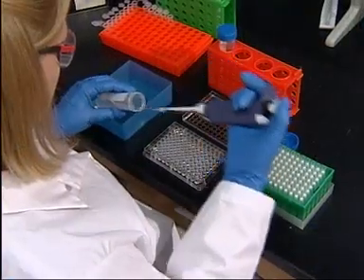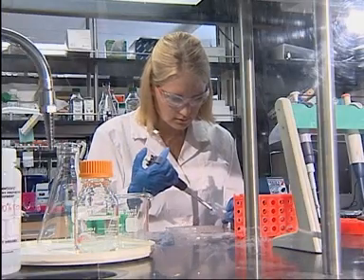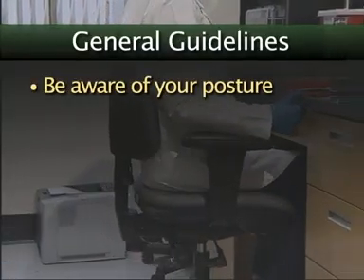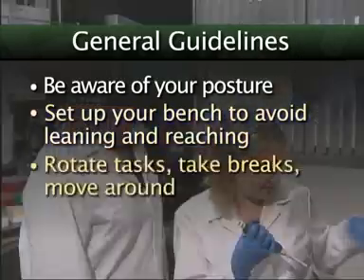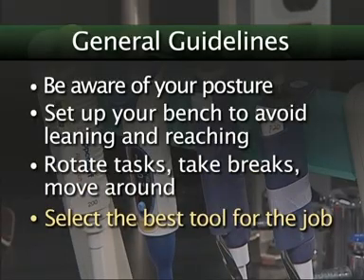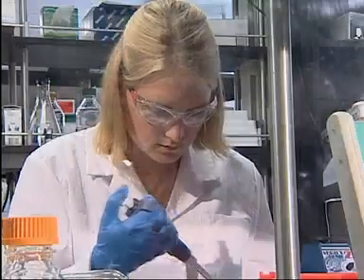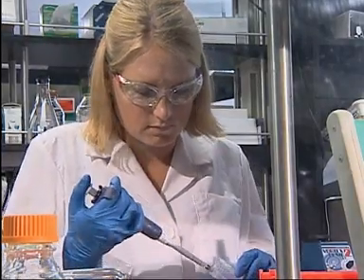If you spend several hours a day pipetting, you know how challenging it can be. Remember the general guidelines we have presented. Be aware of your posture when working. Set up your bench to avoid forward leaning and reaching. Limit static and repetitive work by rotating tasks, taking breaks and moving around. Select the best tool for the job and keep them in proper working order. There is much you can do to protect yourself from fatigue and injury. Be proactive, work safely and take care of your body.